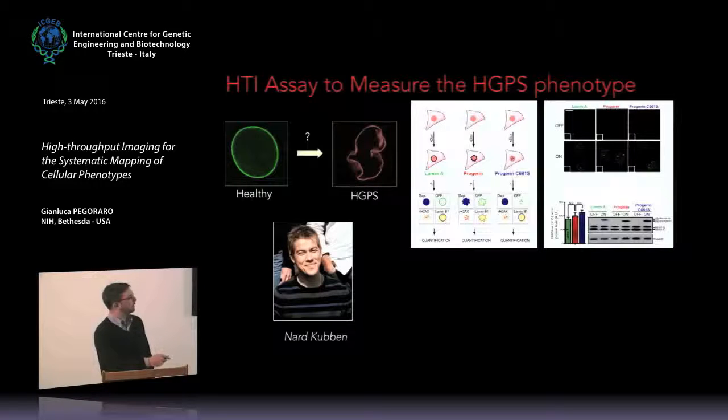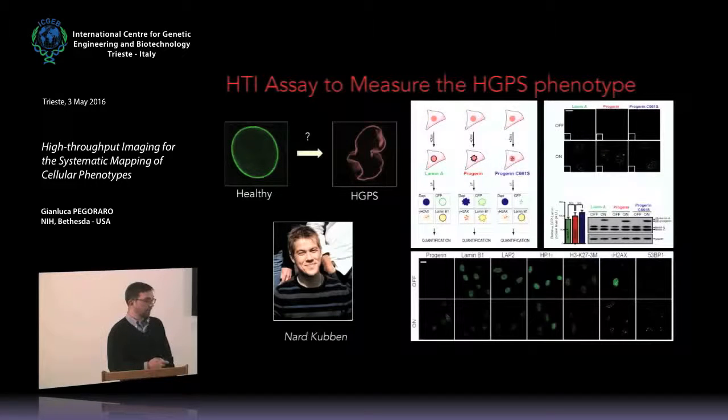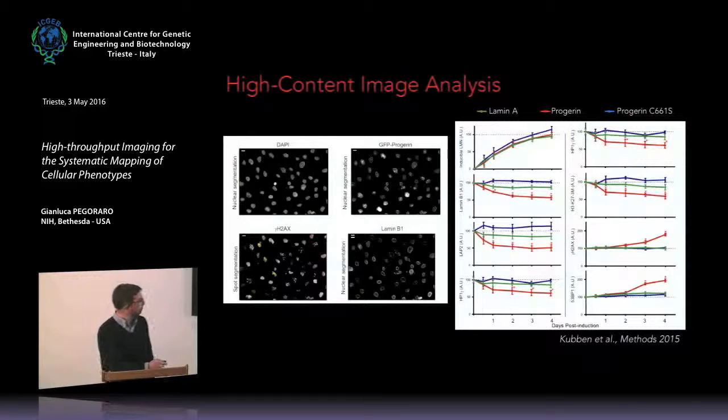These induced proteins were expressed at levels that were comparable to the endogenous version of lamin A, and most importantly, at least from a qualitative standpoint, it was immediately evident that the GFP-tagged version of progerin caused the downregulation of nuclear envelope proteins, of heterochromatin factors, and increased levels of endogenous DNA damage.